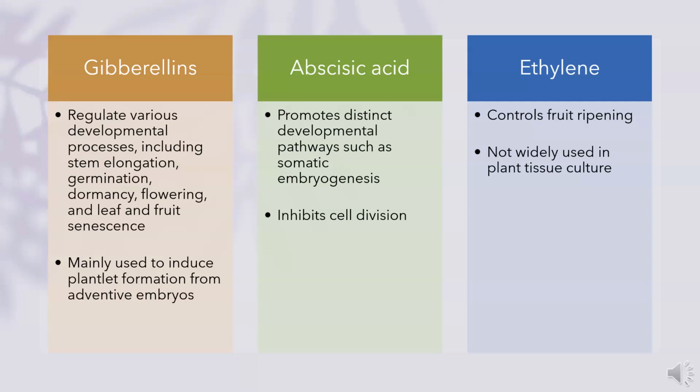Even if the culture technique is perfect, the quality of the culture media used can still affect plant growth and development if it is not properly prepared, such as if it is not sterilized, or if errors occur during the preparation process. Conversely, if the culture technique is not properly executed, the consistency of plant tissue culture would be affected.